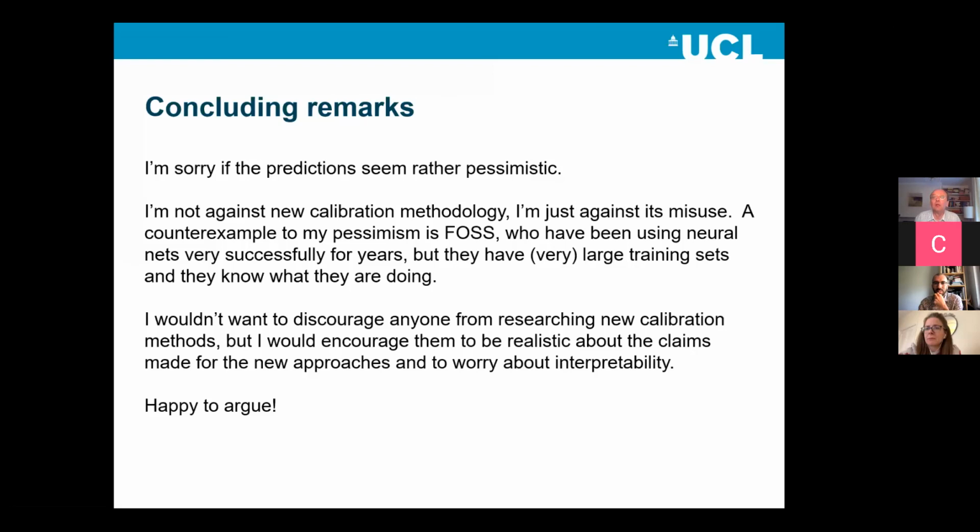The standard advice is that what you need to do is have enough samples to cover the variability in the population that you're going to be predicting for. And that's not just variability in the thing you're going to predict, but variability in all the sorts of things that might interfere with that prediction. So the ideal calibration set is a simple random sample from all the samples you're ever going to analyze in the future. And that's clearly not possible. So you need to think about those samples and you need to get enough samples in your calibration set to represent those. And by the time you've done that, you've got enough, basically, I think.